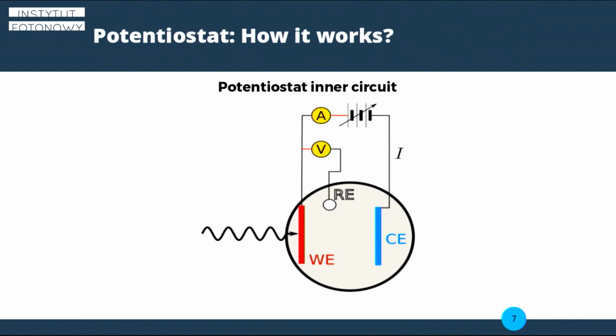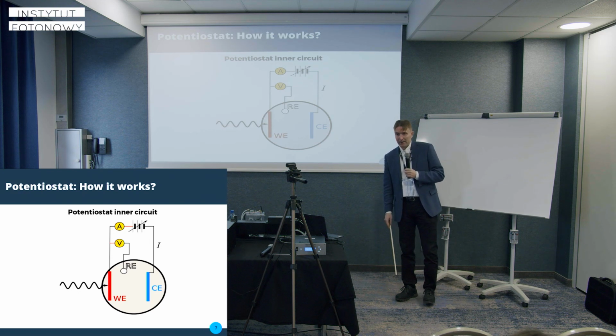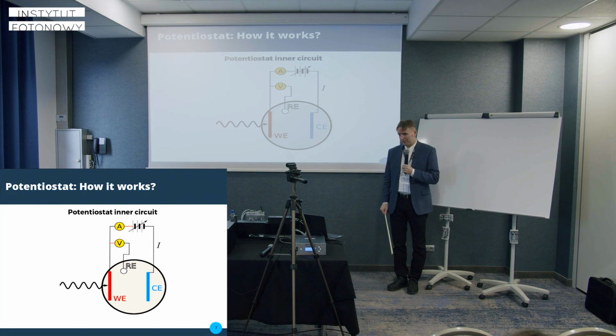I would like to keep this presentation or the workshop basic. So I would like to go back to show you how a potentiostat really works. Because I got confused many times in my life about potentiostats. So I developed those pictures for myself mostly, but I'm gonna share them with you.